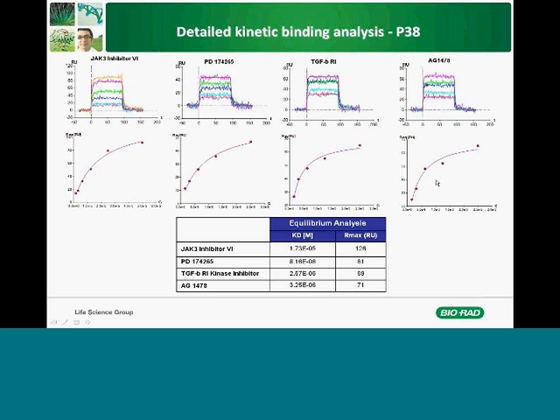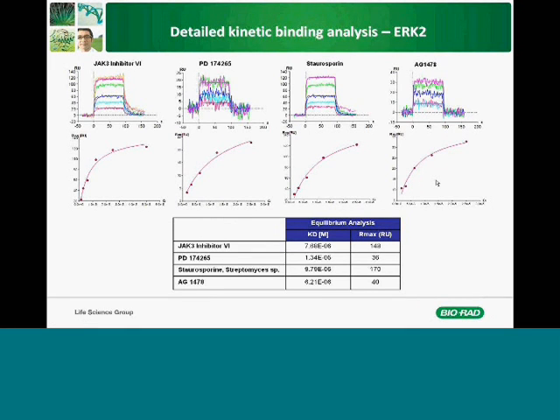And the same for ERK2, the same for compounds. Again, you can see the different binding curves, and in the table below, the affinity.